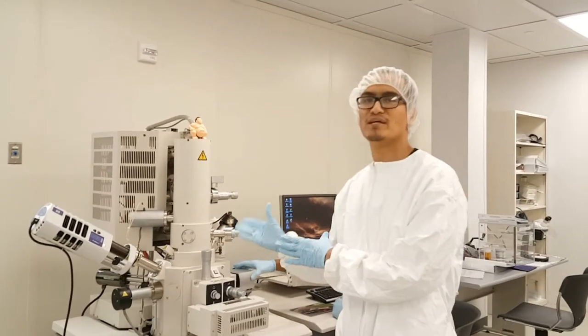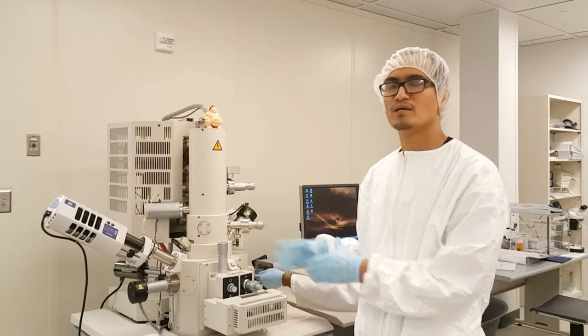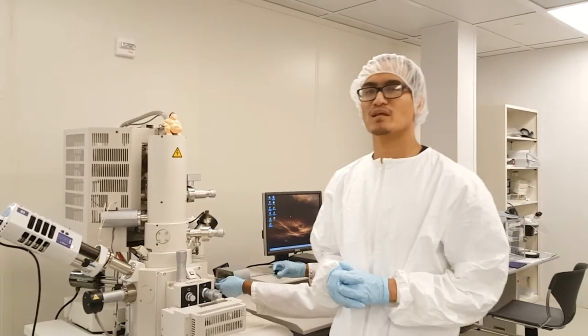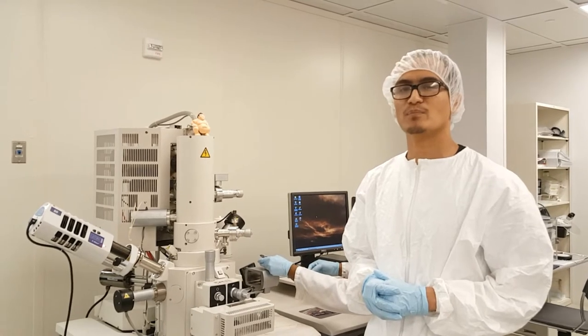So here we have the Hitachi S4700 field emission scanning electron microscope. Scanning electron microscope uses electrons as the probe to image a sample instead of the light in a typical optical microscope.